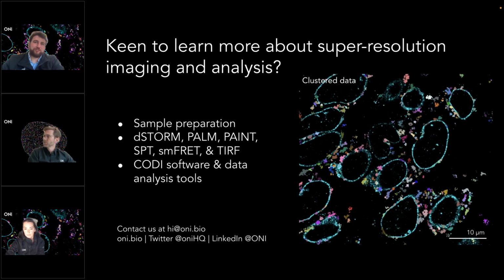And then, of course, you have all the graphs and the numbers, and we saw that each tool is very interactive. When I click on the graph, it will take me to an example of that particular event. We were looking at EVs earlier, so I click on the graph and it took me to that particular EV that maybe was very positive in one of the channels.